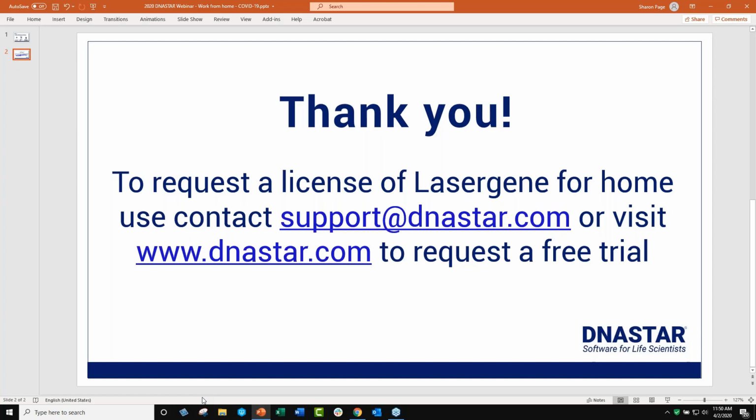To request a license of Lasergene for home use, just contact support@dnastar.com, or just to get the 14-day trial, go ahead and go to our website, and there's a link on every page for the free trial. And then, as Brian said, you can contact customer support to get that extended if you are working from home.